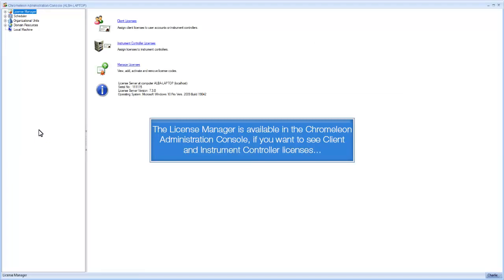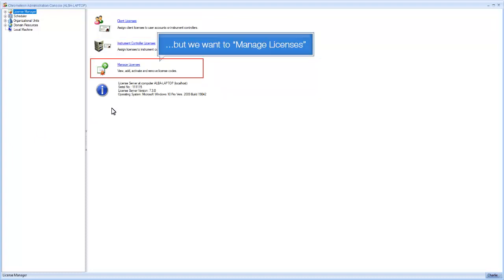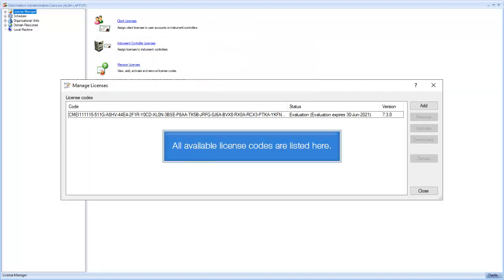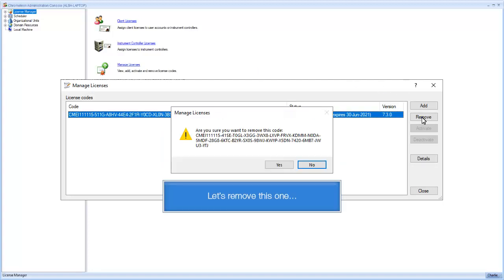The License Manager is available in the Chromelion Administration Console. If you want to see client and instrument controller licenses, but we want to manage licenses. All available license codes are listed here. Let's remove this one.